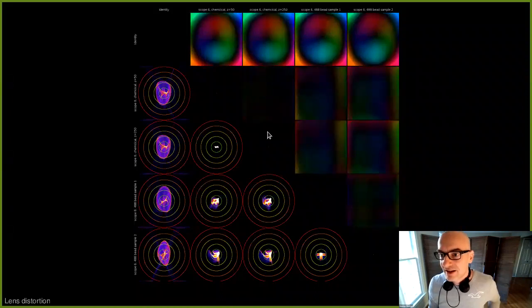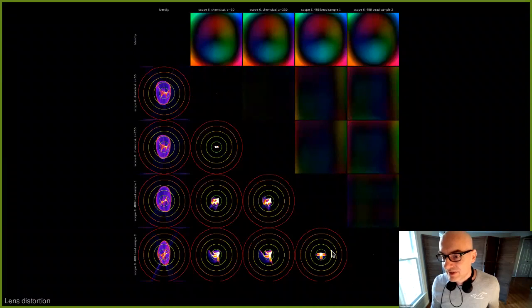And in the next slide, we want to show how this compares to other bead samples on a different microscope. So we have a different microscope. We do exactly the same comparison. Again, we see Z doesn't matter. There is a little bit of a difference between the brain heap and the bead samples, but it's still minor. And the bead samples apparently seem to cover the spaces. So this is consistent. That's great.